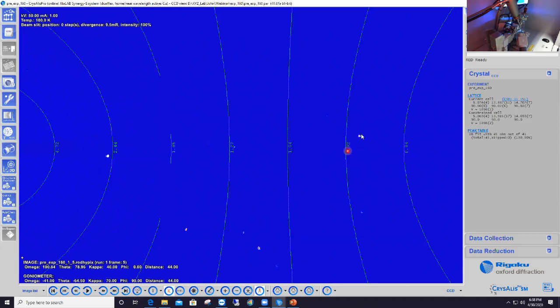And here, obviously, we've got a strong reflection beyond about 0.9 angstrom, and we have others even further. So this is good. So again, reflections spread out through most of your detector area. And then single reflections, remember, no split reflections, and reflections that are not too elongated. So it's always a good idea to also look at your diffraction images.